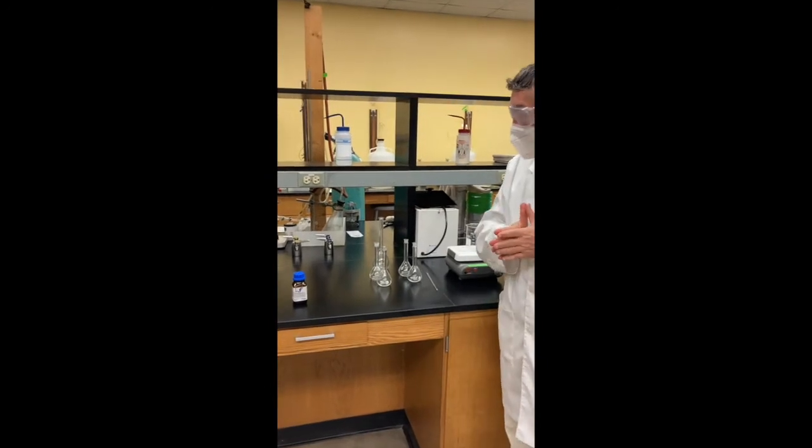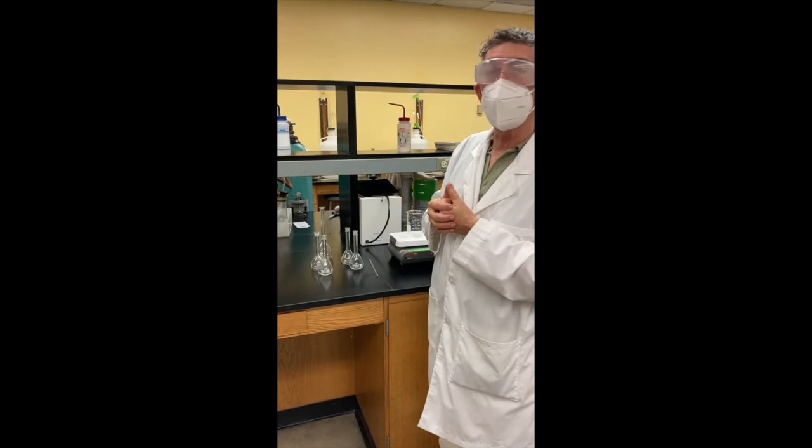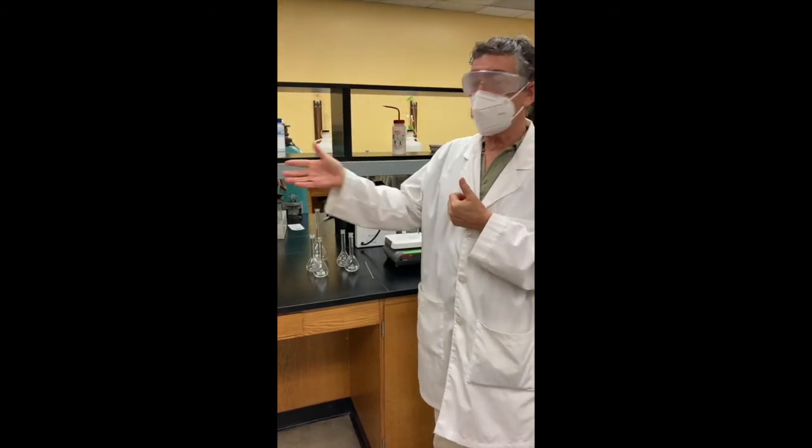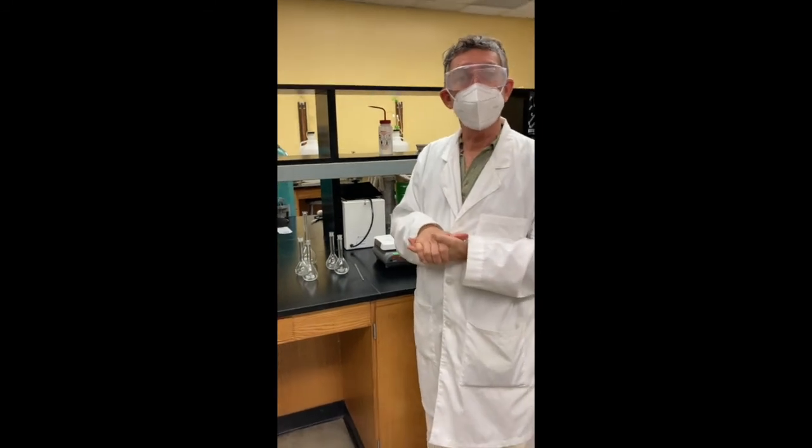Okay. So that's the introduction about how you make the samples, and now we're going to introduce you to the viscometer or viscosimeter and the process of taking your measurements of the viscosity.